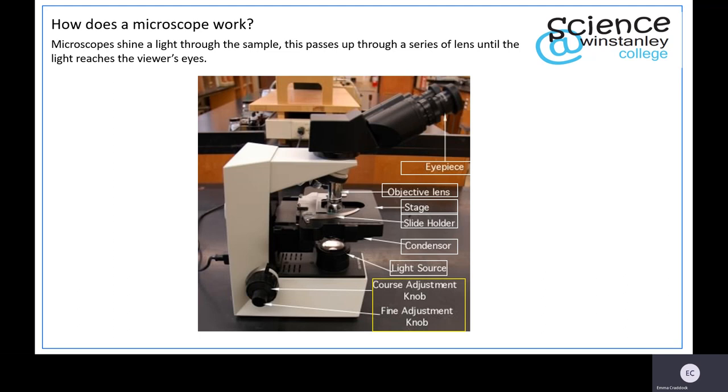If your object looks blurry, you can focus the microscope using the coarse adjustment knob which moves the stage up and down, and then use the fine adjustment knob to focus it so you can see it in minute detail.